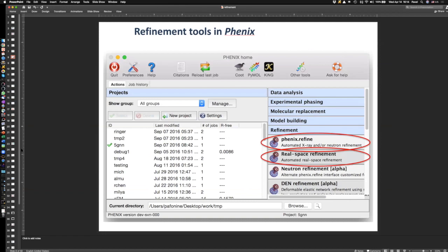Both tools are available on the command line — you can type things in the command line — and you can run them from the GUI. We'll see how that works in the GUI during a live demonstration, hopefully.